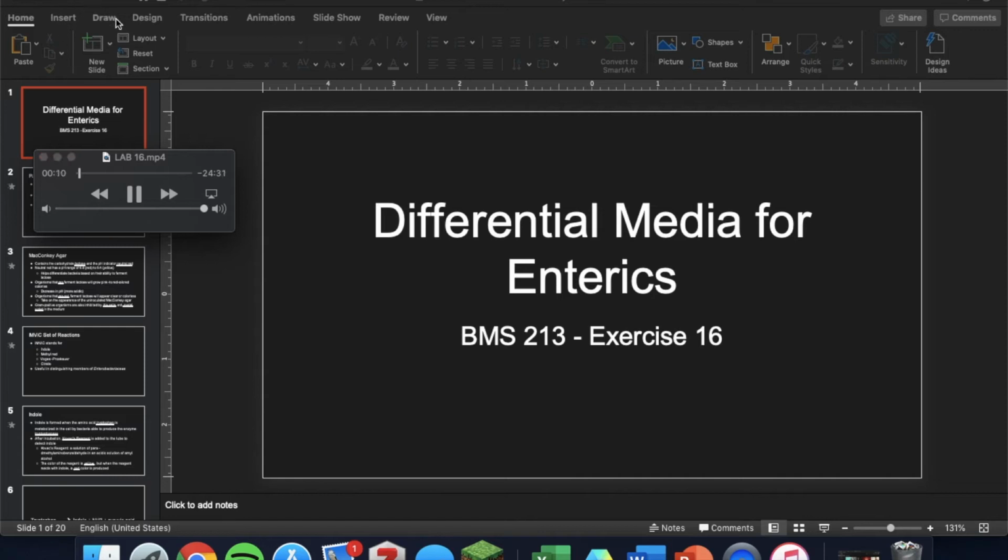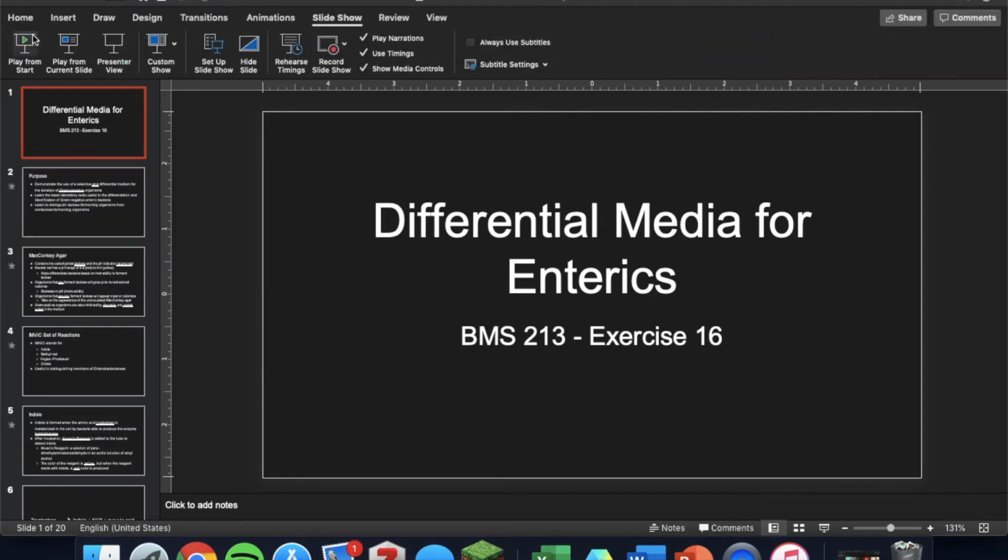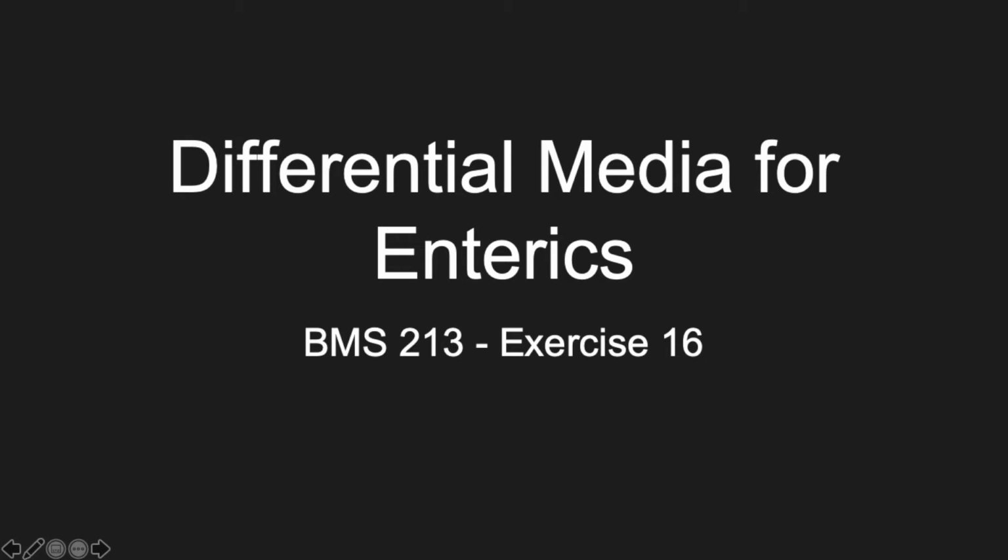Hello, everybody. This is Lab 16, differential media for enterics. There's quite a bit to go over in this lab, a lot of results, a lot of tests, a lot of things happening. So make sure this lab especially is a lab that you take some time to understand.